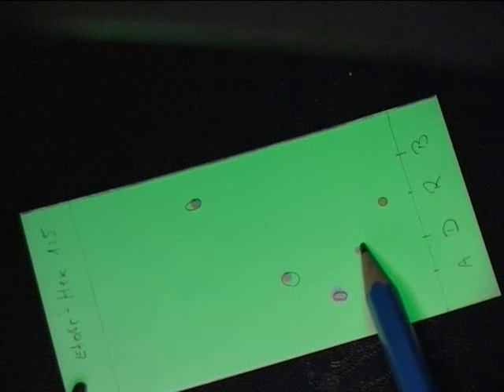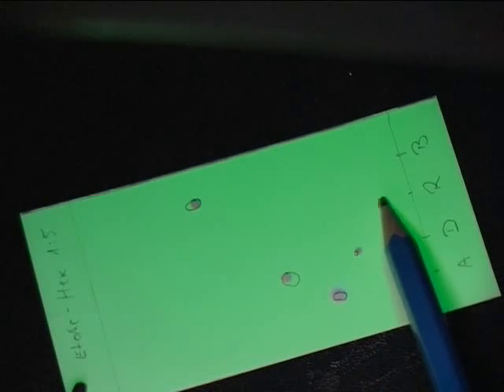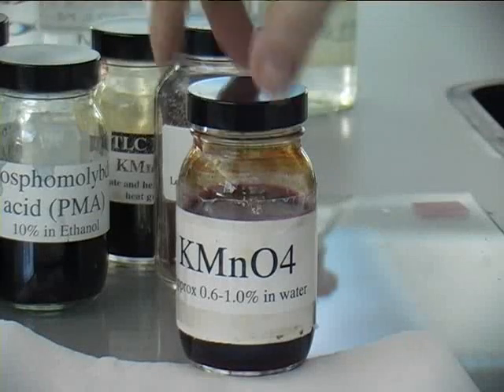The TLC plates are impregnated with an indicator that shows up under a certain wavelength under UV light. That's the light green color. And after you've marked your TLC plates, you can try another type of visualization.